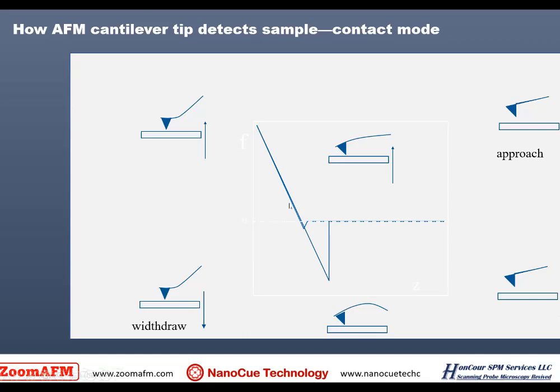Normally, when we are using contact mode, the set point is actually slightly above this zero force line, somewhere here. And then remember that when you have a higher set point, your force is higher.